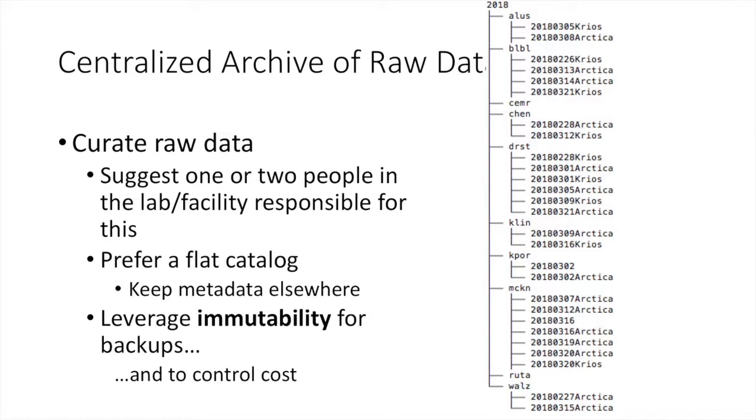If you work with a core facility, it's a great place to capture some of that metadata because you know it at that time. And in a core facility, you can work systematically. If it's an instrument in a lab, it's going to be very difficult to get the lab to enter that metadata. But in a more structured environment, that's going to be possible. So those are things that have worked for us in this model.